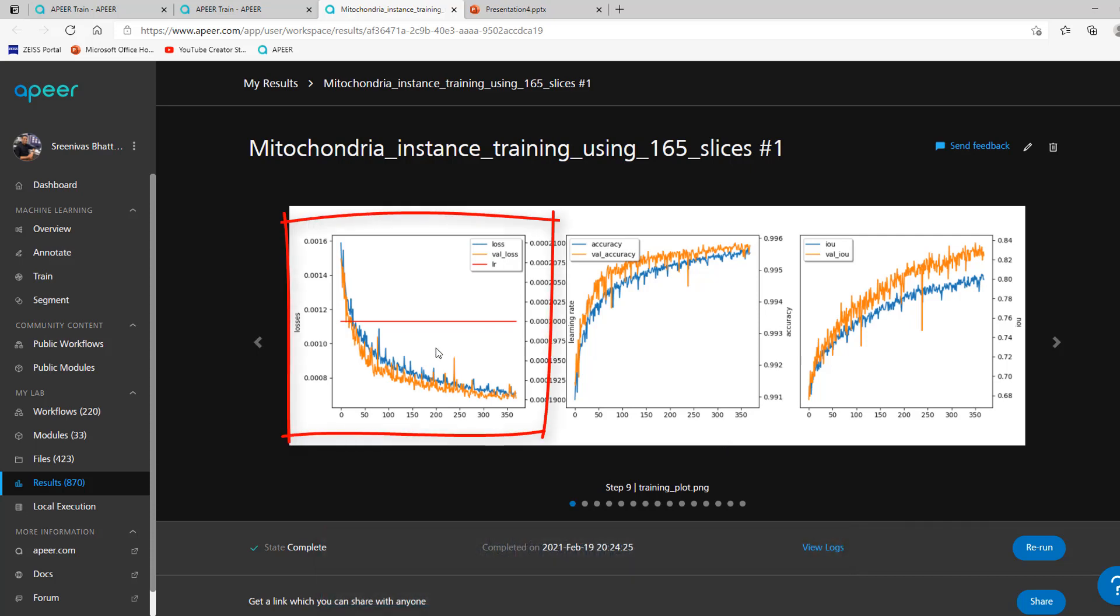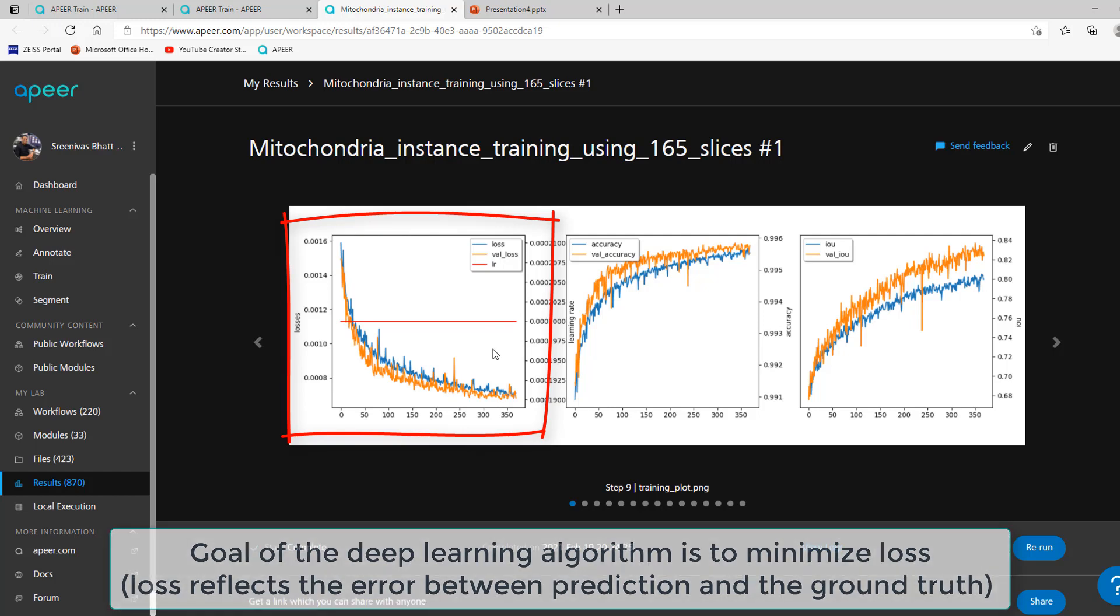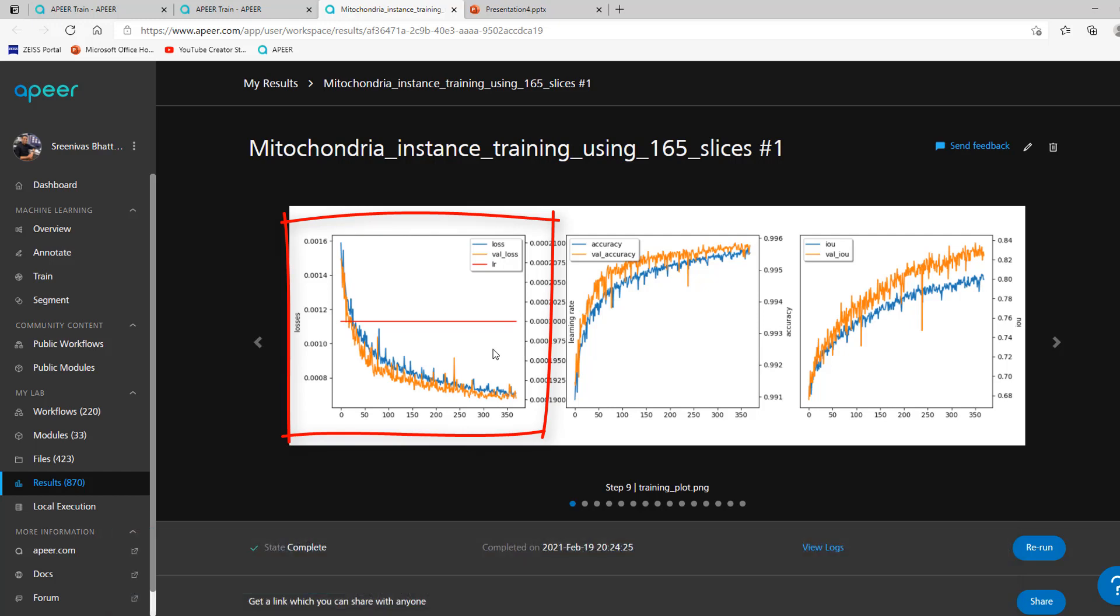Let's start by looking at the loss curves. The goal of deep learning algorithms is to minimize a loss function that reflects the error between the prediction and the ground truth you provided. For good model training, the loss curves trend downward for each epoch and eventually flatten out.